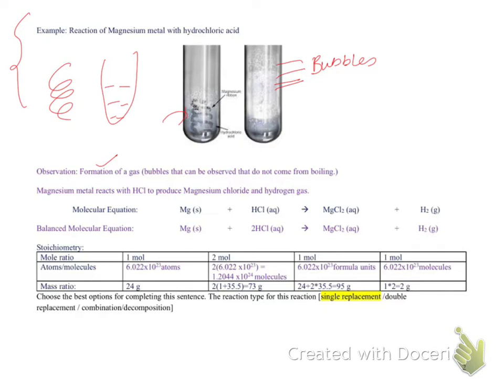So once we did that, what's happening is that magnesium metal, which is the symbol here, is reacting with hydrochloric acid to form magnesium chloride. Now, to write down the formula of magnesium chloride, you have to go back to your chapter 3, where you learned to write the formula for ionic compounds. Magnesium chloride is made up of magnesium and chlorine. Magnesium has a 2+ charge, chlorine has 1 negative. You swap the numbers and the formula is MgCl2.